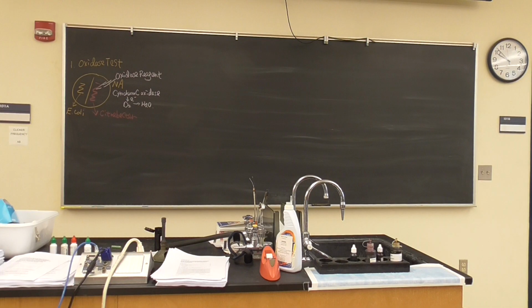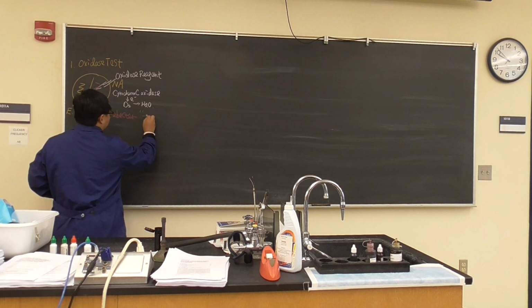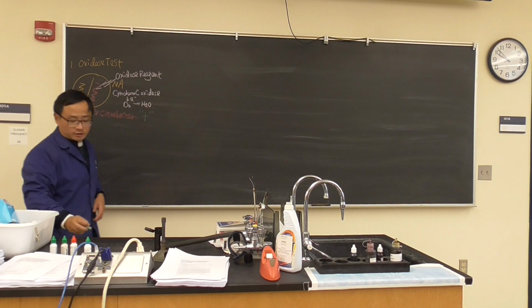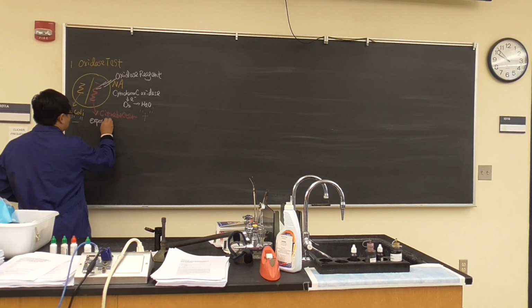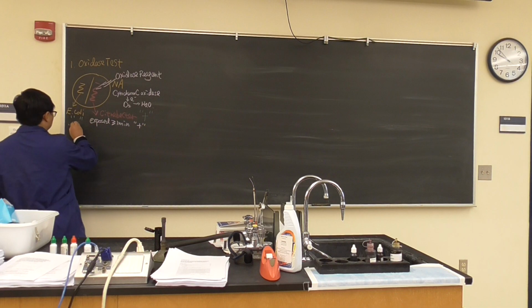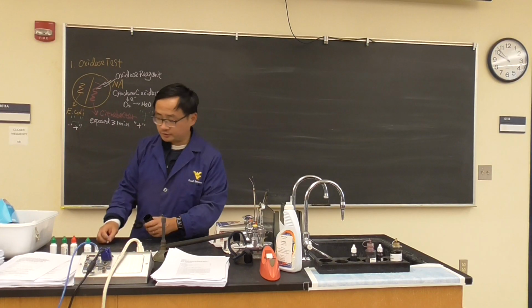You can go ahead and do a drop of these. Ideally, Citrobacter is positive. E. coli is negative. But what we have is we exposed them for more than 1 minute, so they all become positive. This is just a false positive, just to let you know.